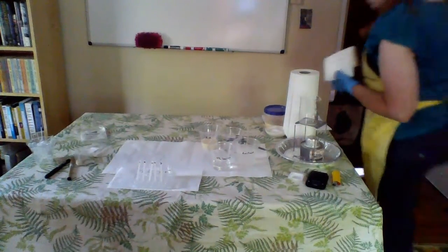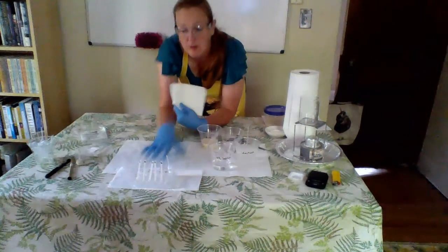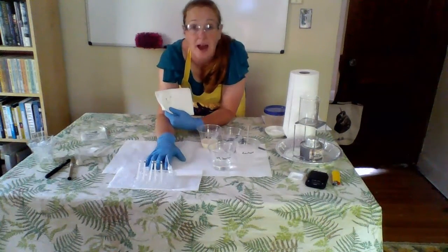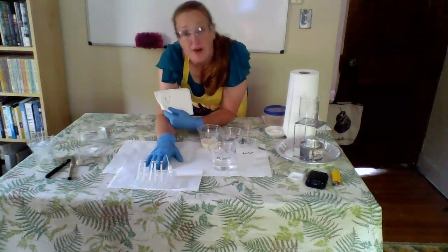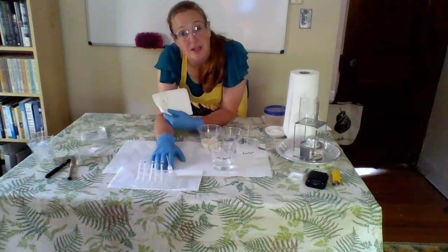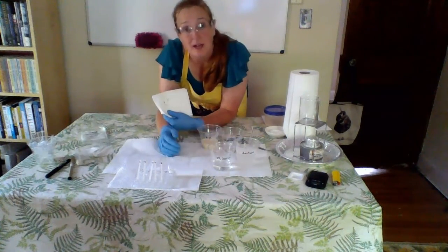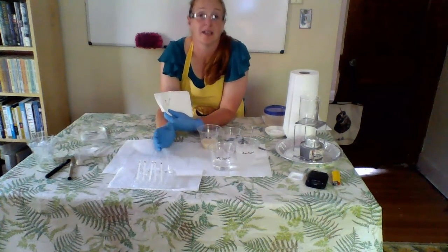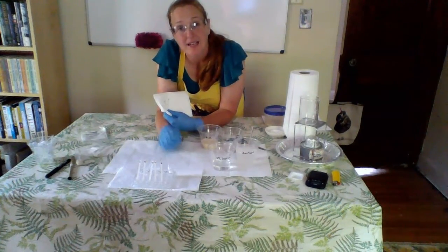So with experiment 1, what we can do with that color chart and these little glucose strips is we can start to get not only a feel of whether or not our solution still has any monosaccharides, any glucose monosaccharides, but then we can also get a feel for how concentrated. So again, this is going to help us to really understand whether or not our lactase enzyme over here was doing any work on the lactose, if our lactase enzyme was able to break that lactose apart.